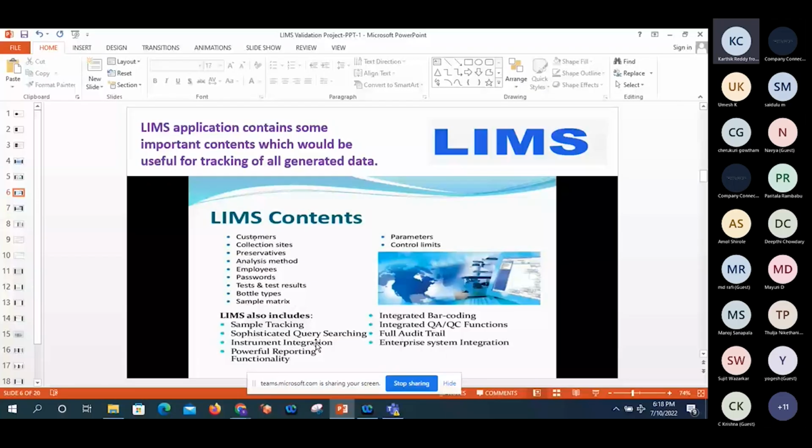Then there is CDS integration, which is called the LIMS CDS interface. Port-based instruments can be taken initially. Why? Because people can understand them easily by writing some parsing scripts. These should generally be written by the vendor. Parsing scripts cannot be easily written by the internal team working on the LIMS core team, but people who take personal training from the vendor can write them, though it is very difficult.